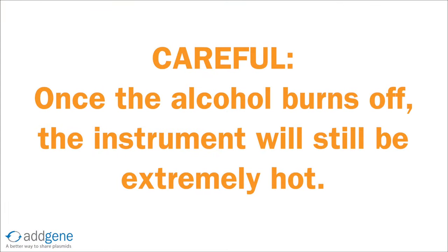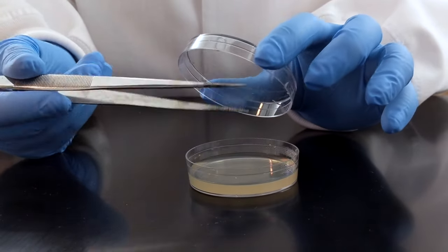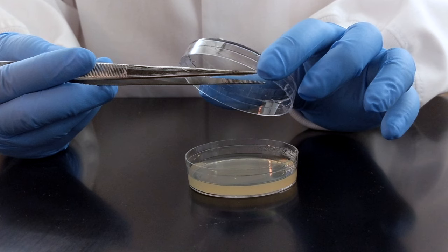Once the alcohol has burnt off, the instrument is sterile, but be careful, it will be extremely hot. If you're going to use the instrument on a live culture such as bacteria, touch the hot tip to the inside of a sterile tube or the surface of an uninoculated culture to cool before contacting the specimen.